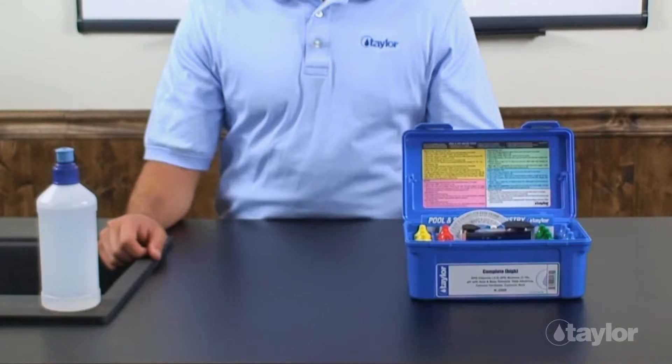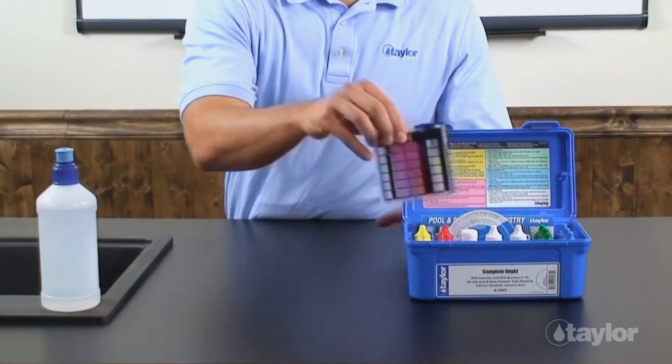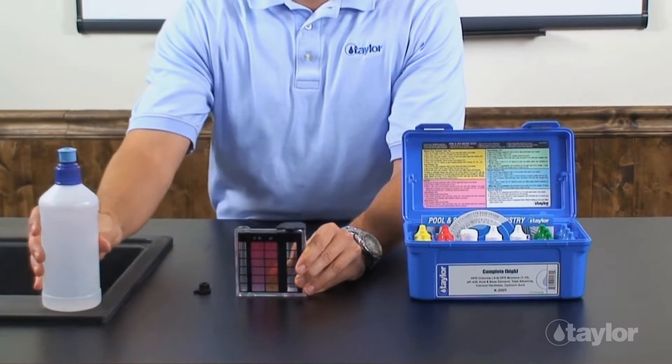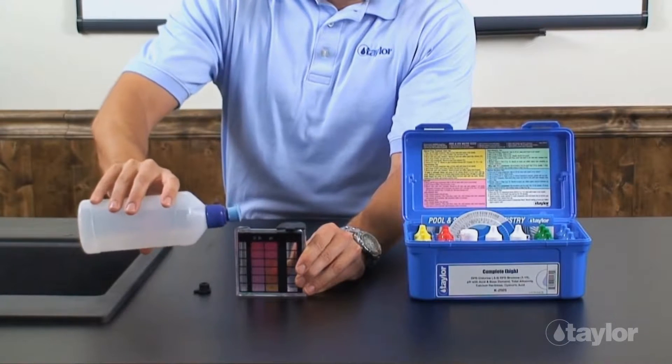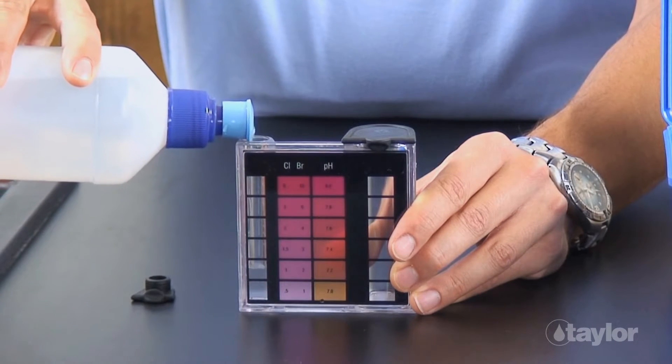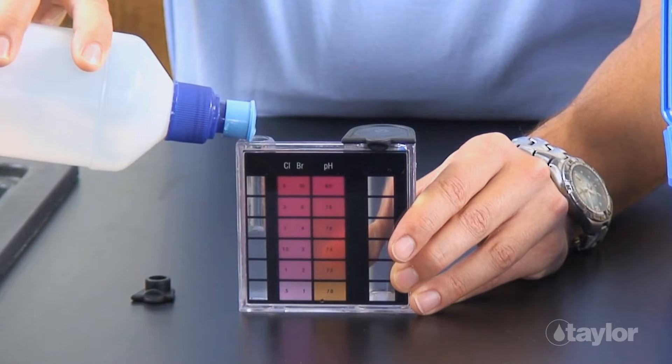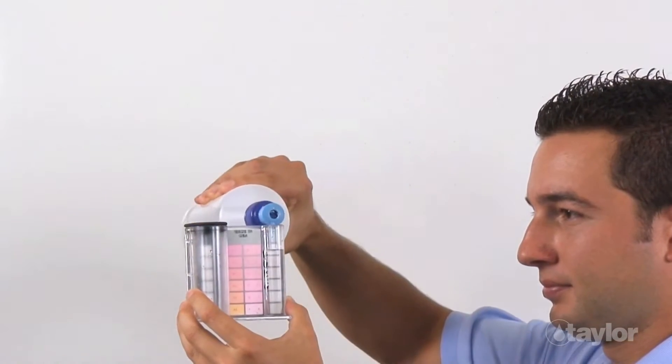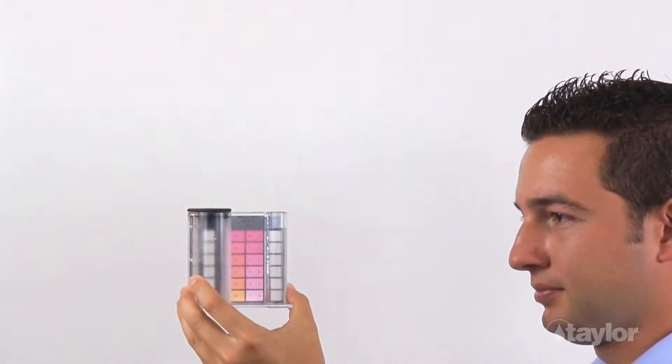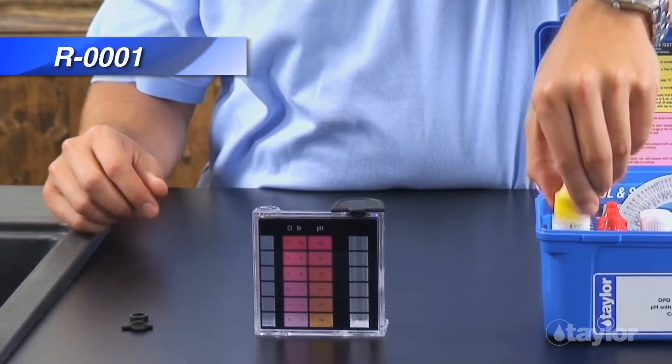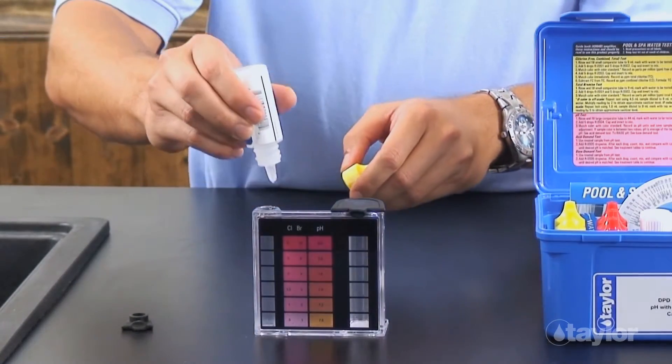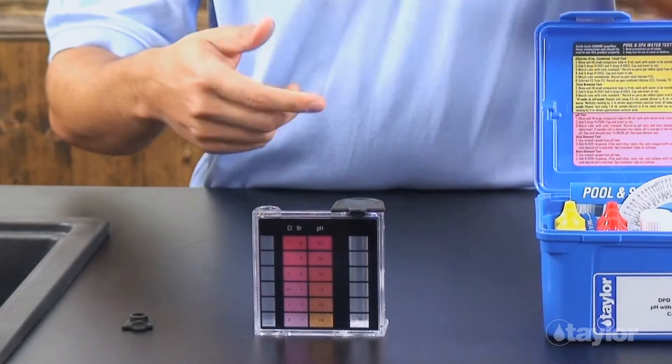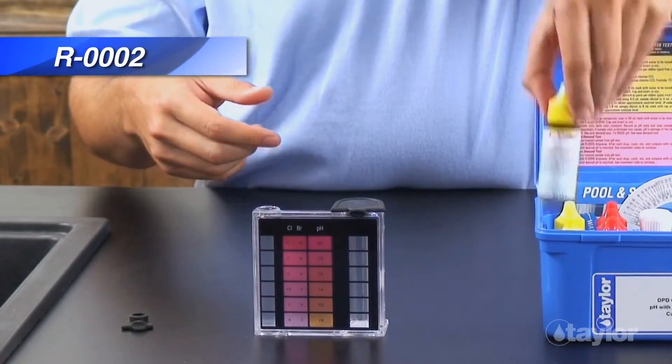To test total bromine, rinse and fill the small comparator tube to the 9 mL mark with the water to be tested. Add 5 drops of Reagent 1 and 5 drops of Reagent 2.